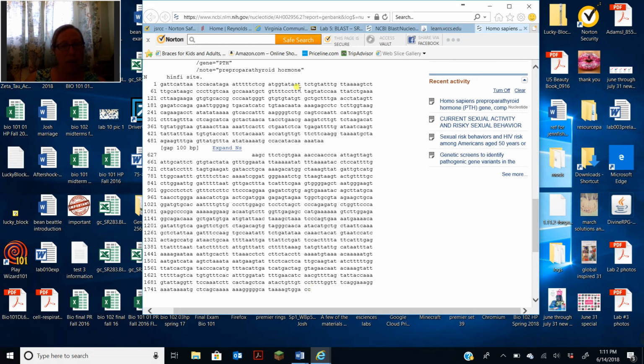It'll give you a sequence, and you may have to have this piece of paper out, sitting there trying to figure out where it was homologous or where it wasn't homologous, or vice versa. But as you can see, this is going to save a lot of time, at least in terms of the big picture, trying to find the identity of something or compare it and confirm the identity of it. It doesn't get down to the nitty gritty, but it can be very, very useful in terms of identification and just learning about something.